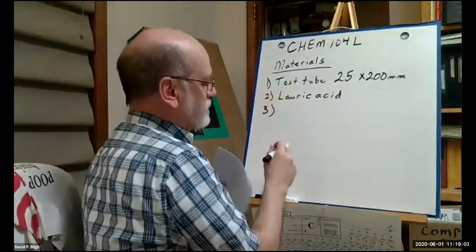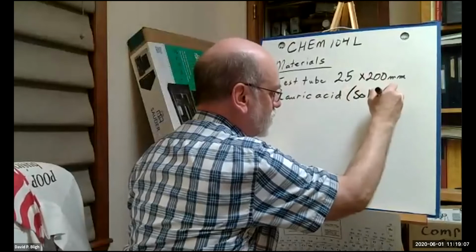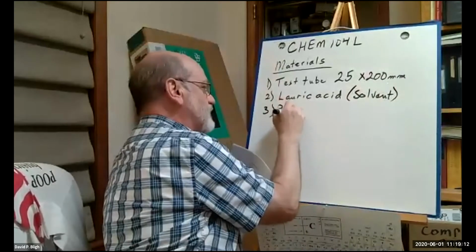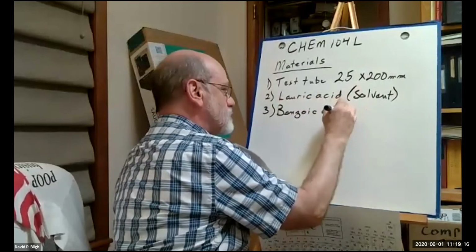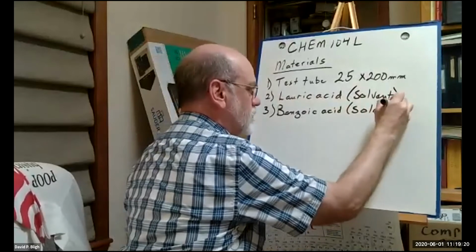Then we need, that's the solvent. All right. Now we need our solute, which is benzoic acid. Okay, that's our solute.